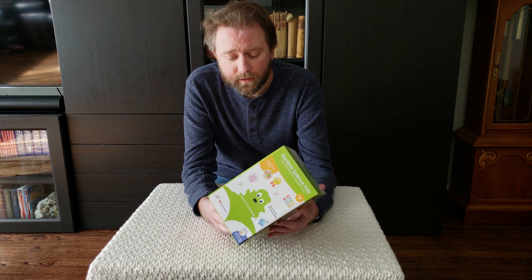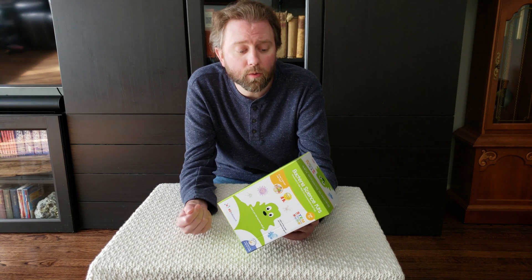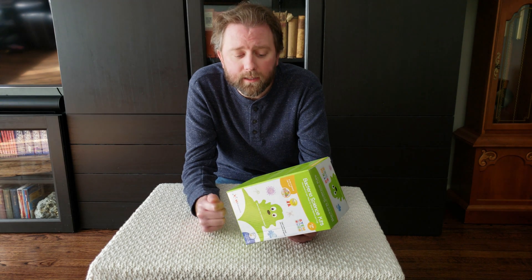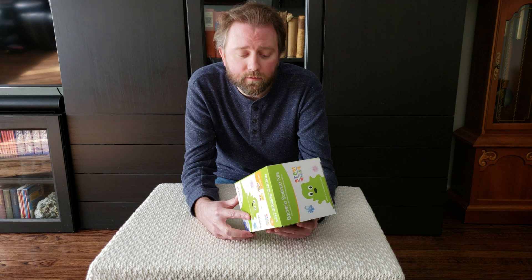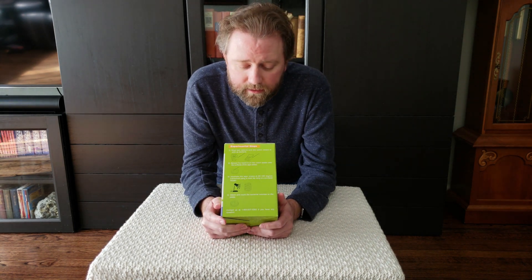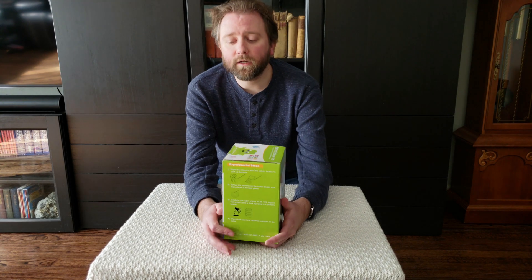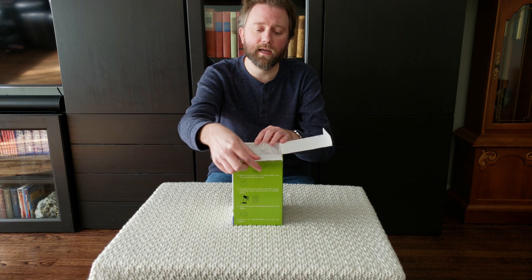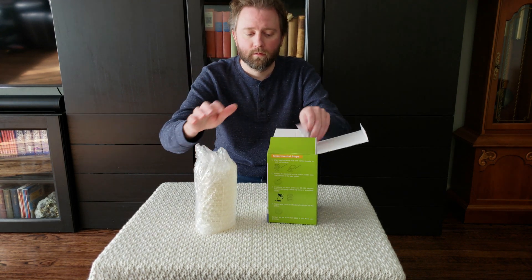This is the box it comes in. Essentially what it does is it gives you a ton of little swabs and a ton of little Petri dishes. You swab the various devices around your house, transfer that to the Petri dish, then incubate it. It says you must have a light that keeps a consistent temperature of 85 to 100 degrees Fahrenheit. You may want to save this for summer, or if you have a little space heater or a really hot lamp to incubate it so the bacteria actually grows.